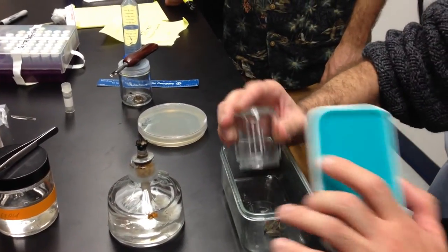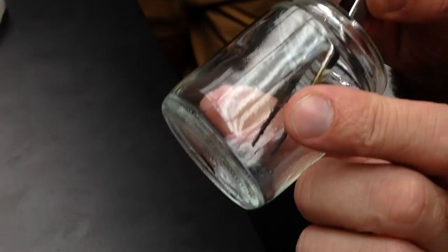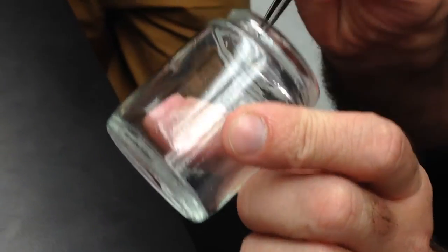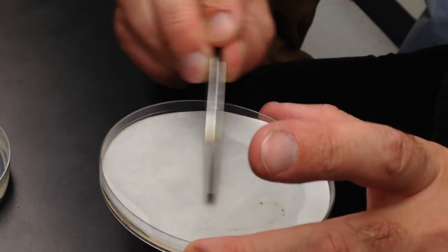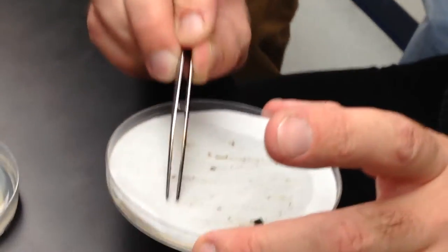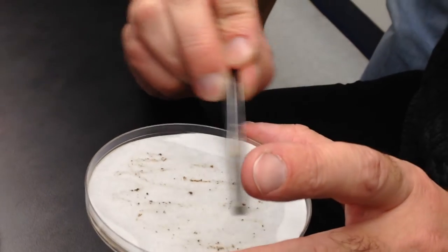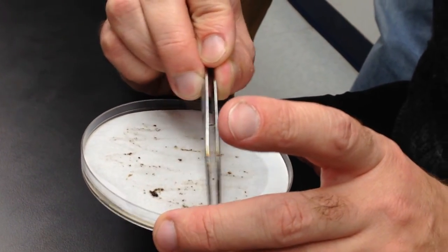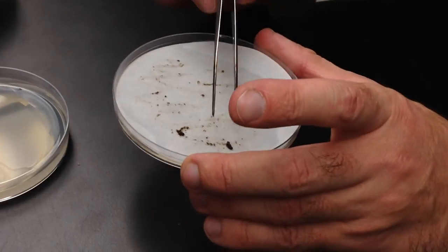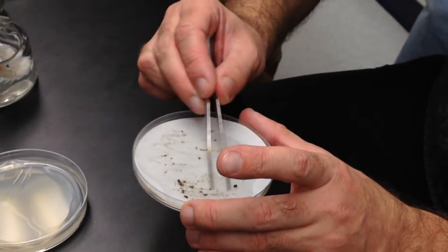There you go. So now we have our poop sample, and we just need to make, like, Raphael or Michelangelo kind of stuff — very nice and artistic. Do you want to look at the poop under the microscope to see if it has spores? I never do. Why not? Well, I should, as a scientist, but I know it works anyway, so I don't care.